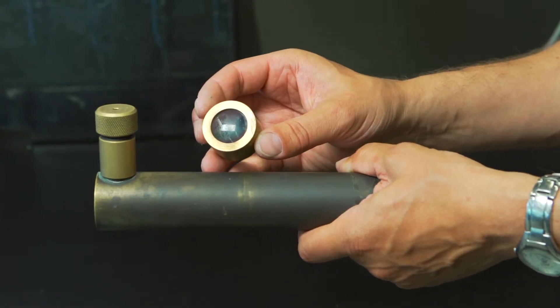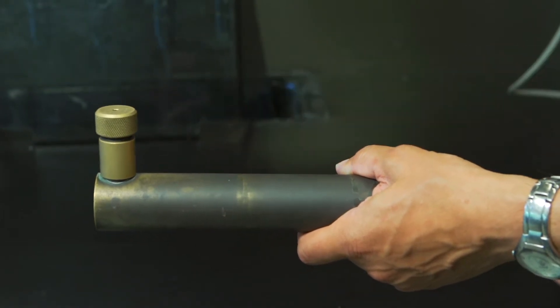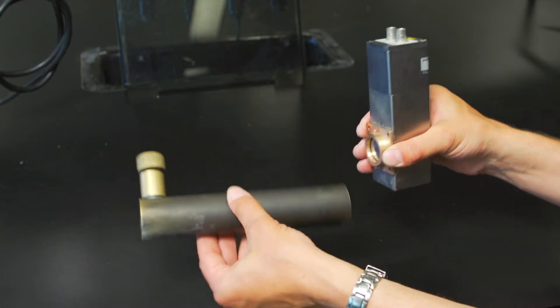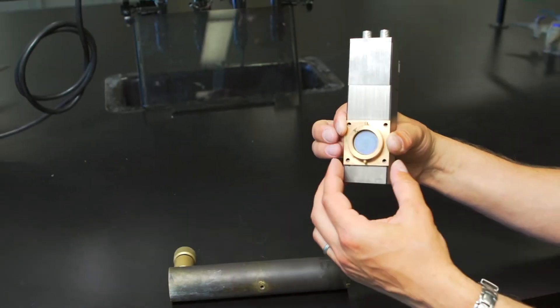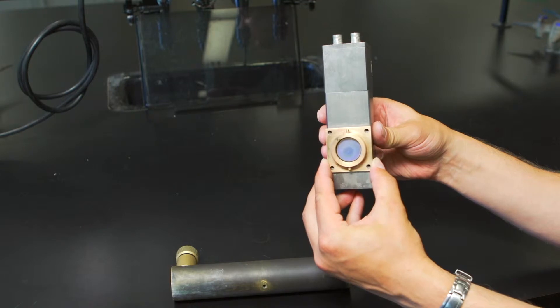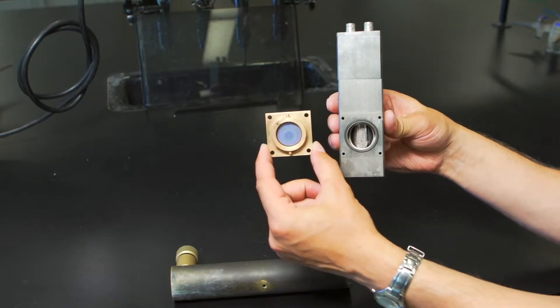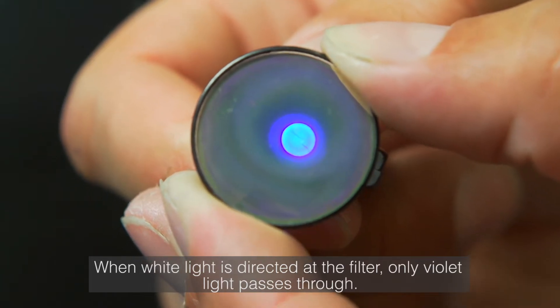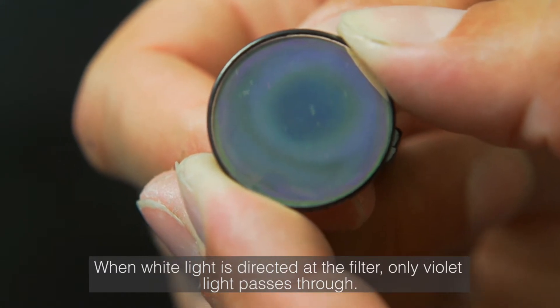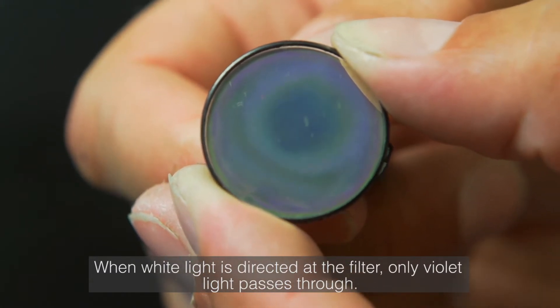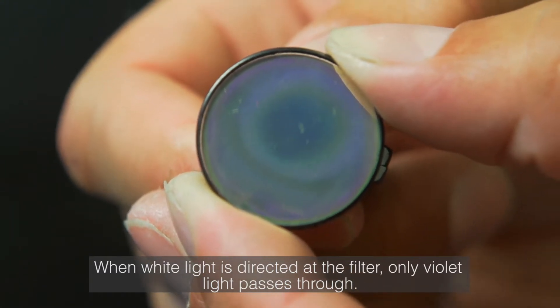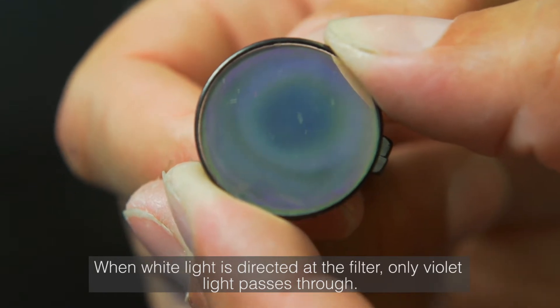The photons continue through the tube until they reach an optical filter. The bandpass filter has a maximum transmission at 460 nanometers, the wavelength of the emitted photons for the chemiluminescence reaction. The optical filter looks like a mirror because it reflects most wavelengths. It transmits only in the range of 450 to 470 nanometers, reflecting everything else.